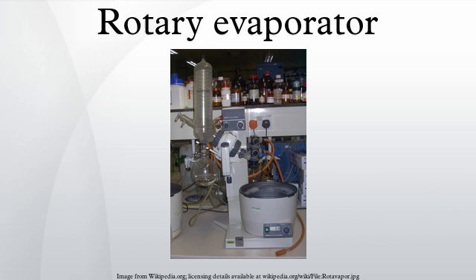However, more recent developments are often applied in these cases. Rotary evaporation for high-boiling hydrogen bond-forming solvents such as water is often a last recourse, as other evaporation methods or freeze-drying are available. This is partly due to the fact that in such solvents, the tendency to bump is accentuated.